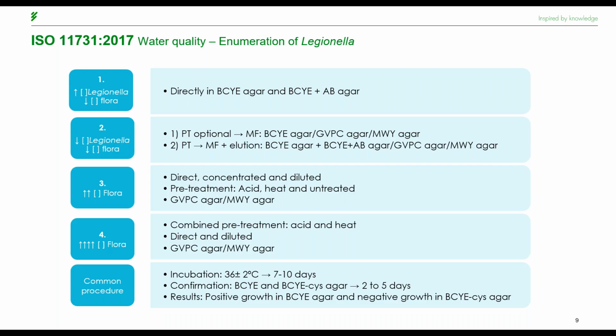This depends mainly on the sample to be analyzed and its origin, which will allow us to ensure the detection of Legionella. It is very important since Legionella is a slow-growing bacteria and the accompanying flora can prevent or even delay its development. There are different procedures according to the sample to be analyzed, and this is to ensure the detection of the Legionella in it. The origin and nature of the sample indicates the treatment to be followed. So let's go right at it.